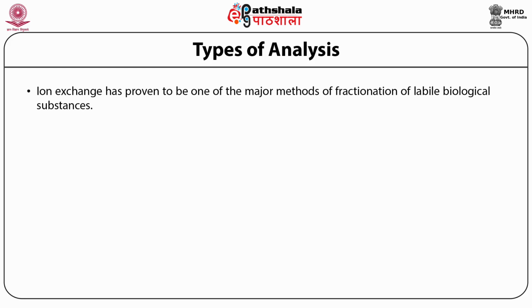Types of analysis. Ion exchange has proven to be one of the major methods of fractionation of labile biological substances.